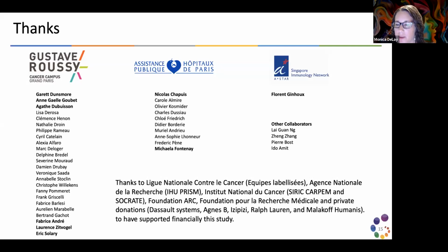Okay. Another question: can you comment on any steps you took for optimizing your panel? So, for example, in my case, I made a few mistakes the first time I used it. Since you have Alexa 488 and BB515 that you can use at the same time on the Aurora, do use markers that are really far from each other, for example, CD4 and CD8.